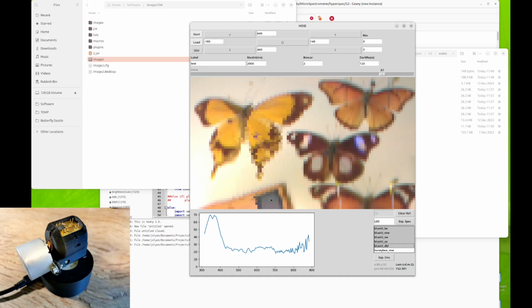Once we have selected the reflectance standard in our image, where previously if I clicked on any pixel and exported the spectrum, it would record radiance. Now we've selected a reflectance mode. This will export reflectance instead.